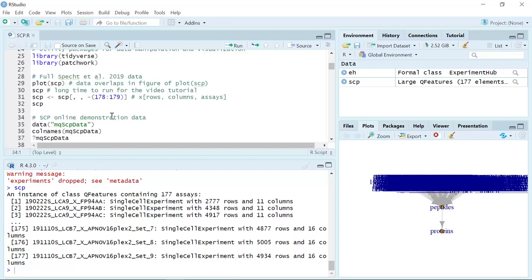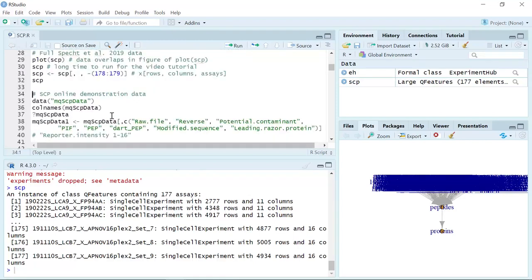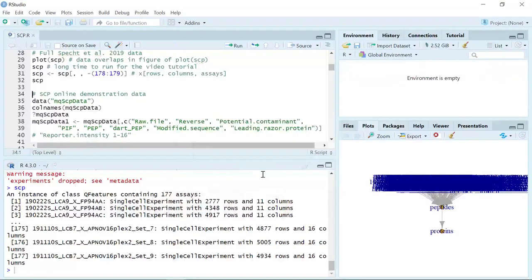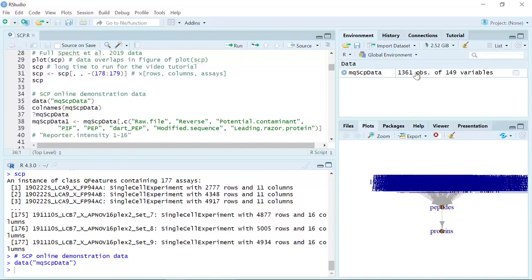For my video tutorial, I'm going to use the simplified data set for the demonstration. So let's clear the full data set, then we can load the simplified data set and name it MQSCP data. You can see now it has 1361 observations with 149 variables.